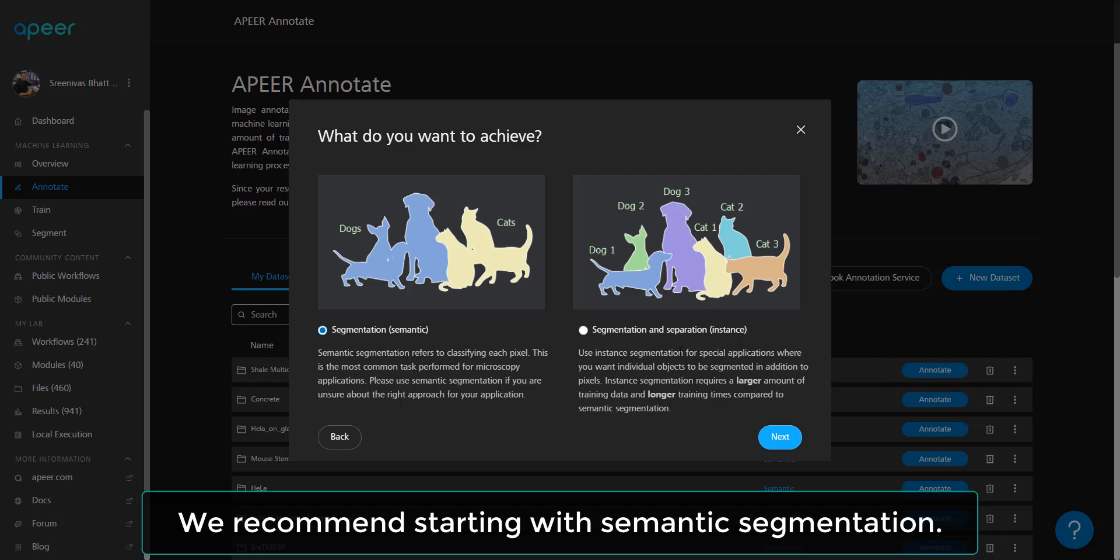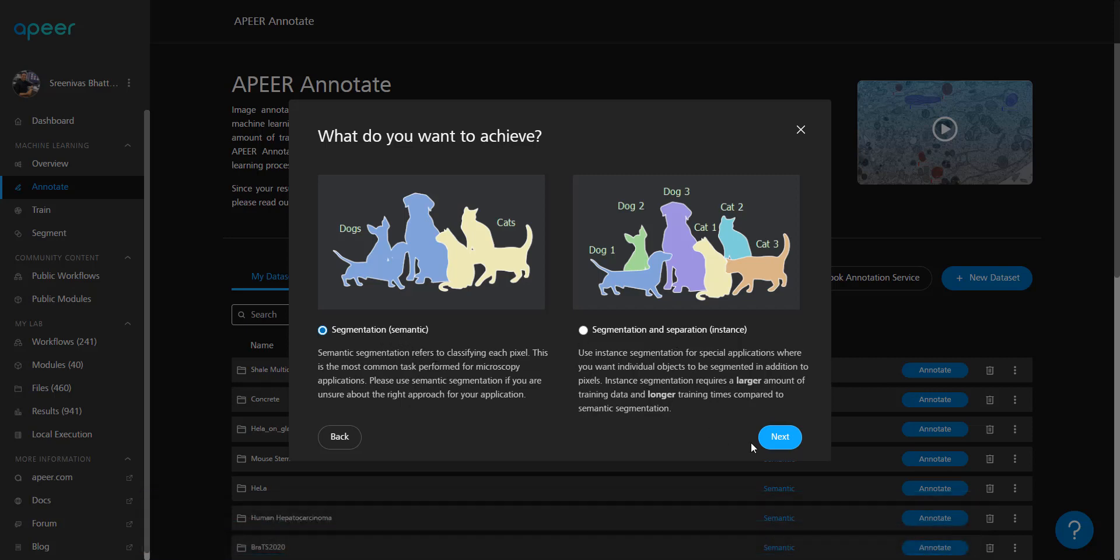If you're unsure of which one is appropriate for your dataset, go ahead and leave it to semantic segmentation. Let's hit next.